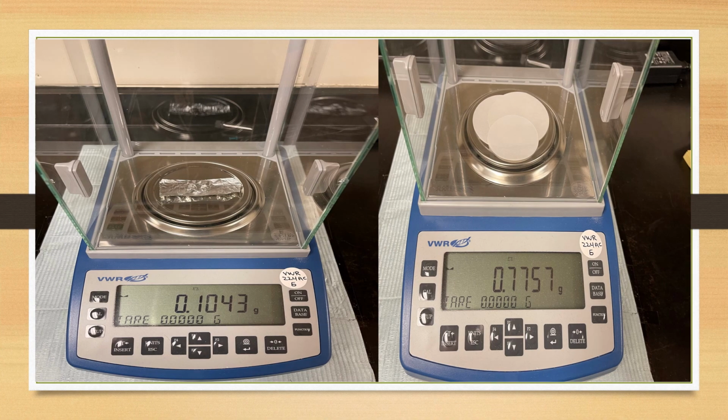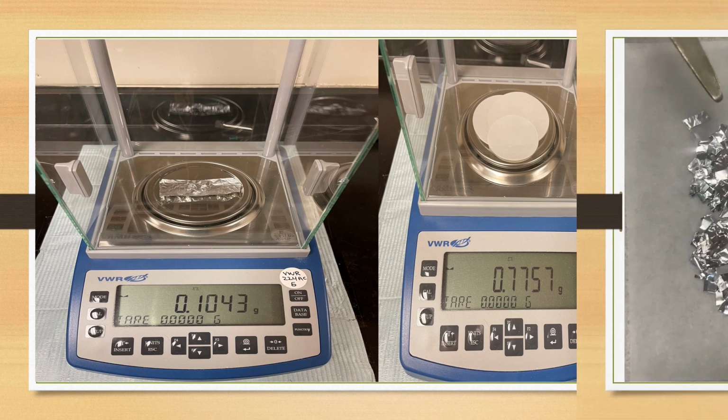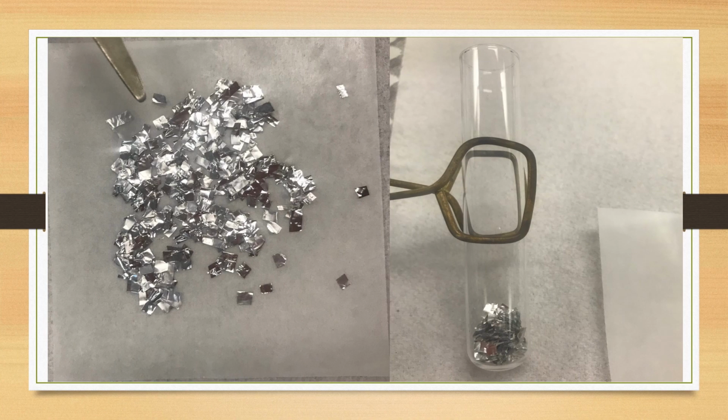On the analytical balance, accurately weigh approximately 0.1 gram of aluminum foil and record the mass in your laboratory notebook. Next, weigh 1 small and 2 large filter papers and record the mass in your laboratory notebook as well. The synthesis will be carried out in the following stages.